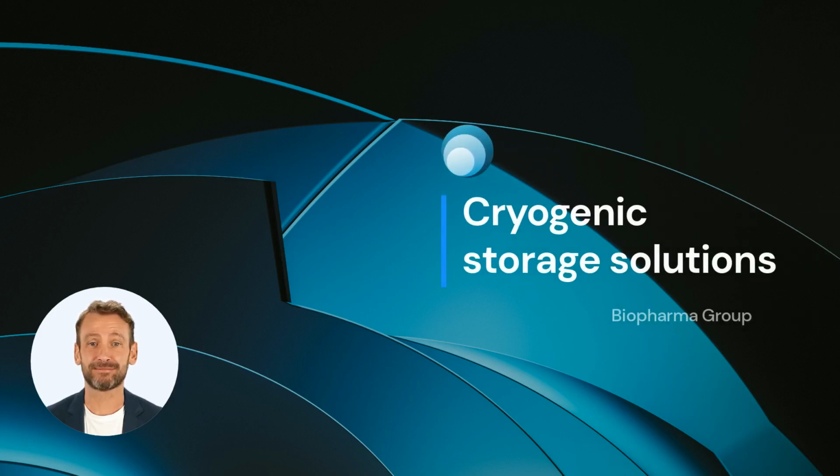Hi. In this video, we would like to cover some important aspects within cryogenic preservation. We will look at concerns such as sample security and sample longevity. With this in mind, we will introduce you to the latest technology solutions that are available, including semi and full automation systems. So let's start.